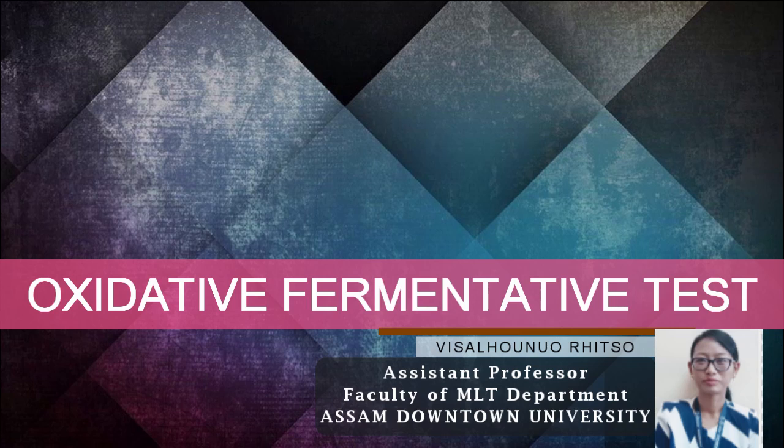Saccharolytic microorganisms degrade glucose either fermentatively or oxidatively. The end products of fermentation are relatively strong mixed acids that can be detected in a conventional fermentation test medium. However, the acids formed in oxidative degradation of glucose are extremely weak, and the more sensitive oxidation fermentation medium of Hugh and Leifson, OF medium, is required for the detection.